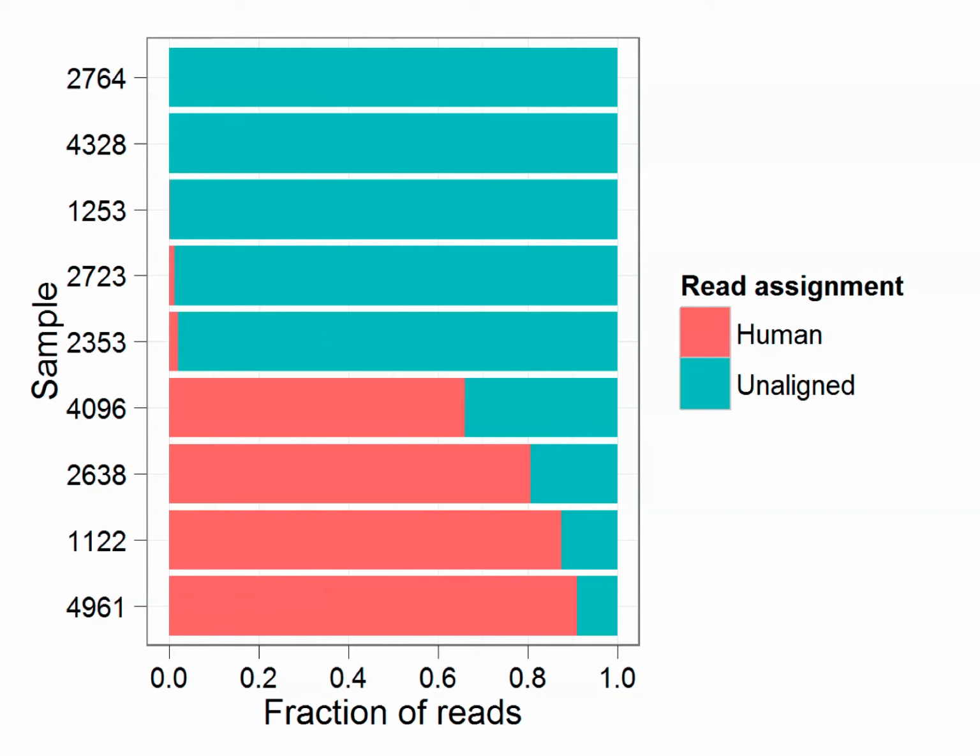And what we found, though, was rather strange, that in some of the samples, the human reads actually predominated, up to 90% or so. In others, there weren't any. So, what counts as a stool sample and what's in a stool sample obviously varies quite a lot from one sample to another. And we can't think of any artifactual reason why this might be the case in terms of what we did with the DNA. It must be something to do with the kind of samples.